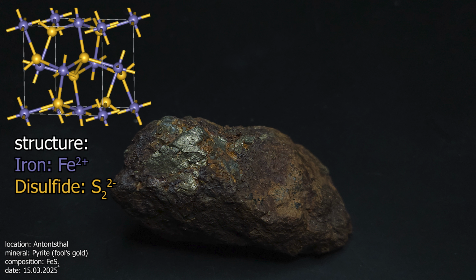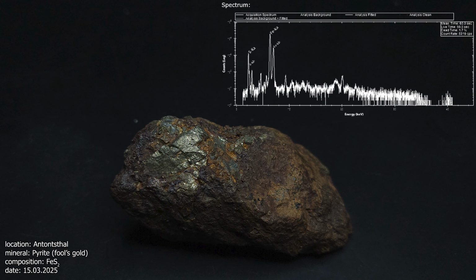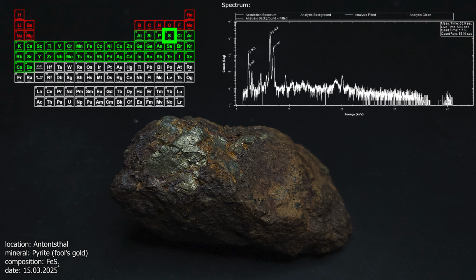Back to our minerals. All the chemistry that then ensured that we have disulfide ions and so on takes place at the valence shell, which is not really of interest to us during XRF measurements. This means that although I could see from the K-alpha line that sulfur is present in the sample, I cannot make a statement about its chemical form. So you kind of have to approach things with a bit of chemical intuition and then say, okay, if iron is present, it stands to reason that sulfur is negatively charged, but strictly speaking, that's just a guess.